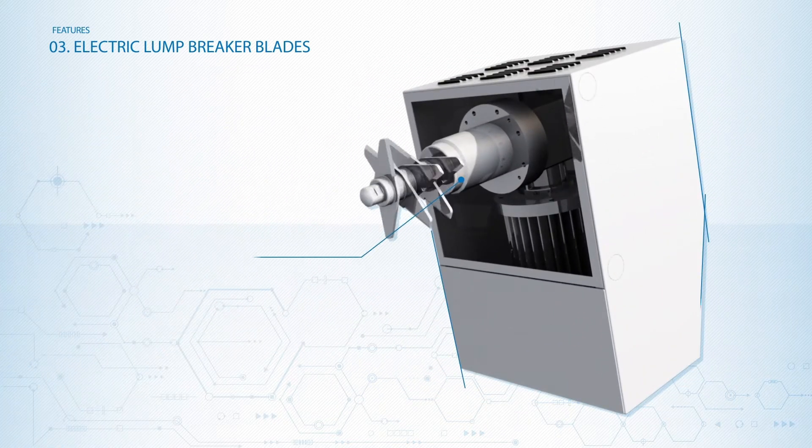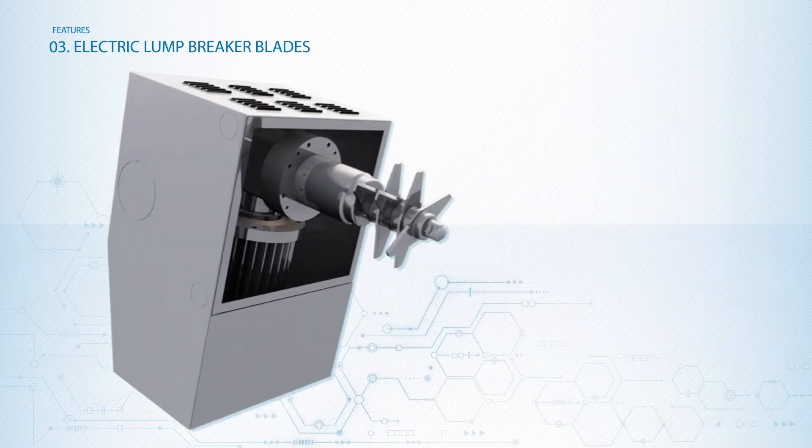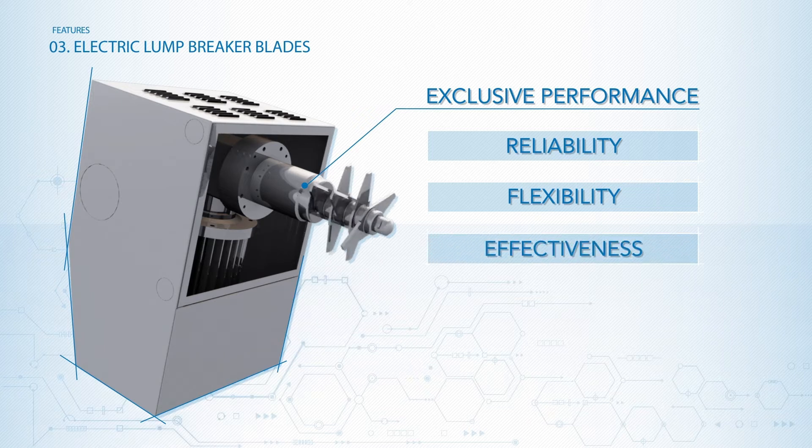The CREOX system's motor-driven lump breakers are electronically operated. This crucial feature offers exclusive performance and benefits, guaranteeing reliability, flexibility and efficacy, even in heavy duty.